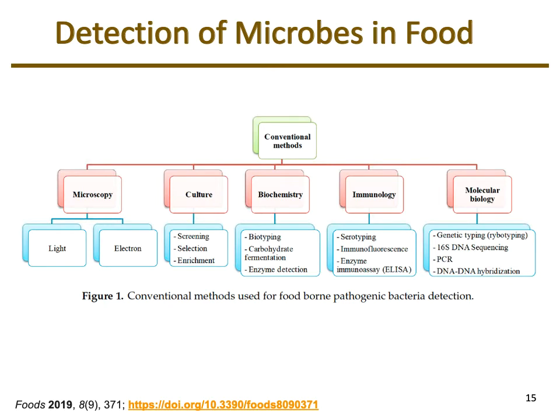So again, we want to keep in mind that some of the conventional methods that are utilized are looking under the microscope and trying to detect using either light or electron microscope, and culturing methods. Again, those are methods that a lot of them you learned in an intro microbiology lab, which involves screening and selecting and enriching and utilizing all these different types of media. But they also take time.